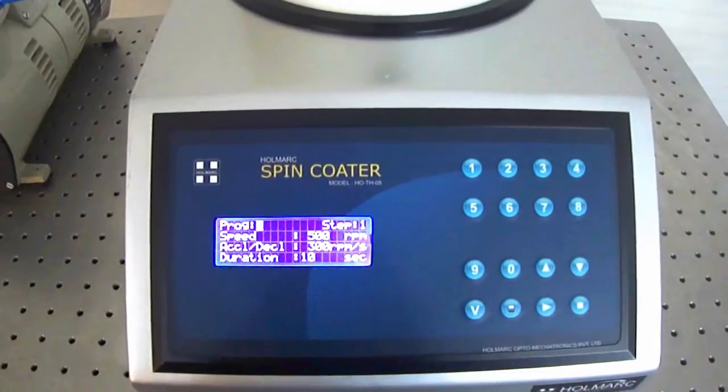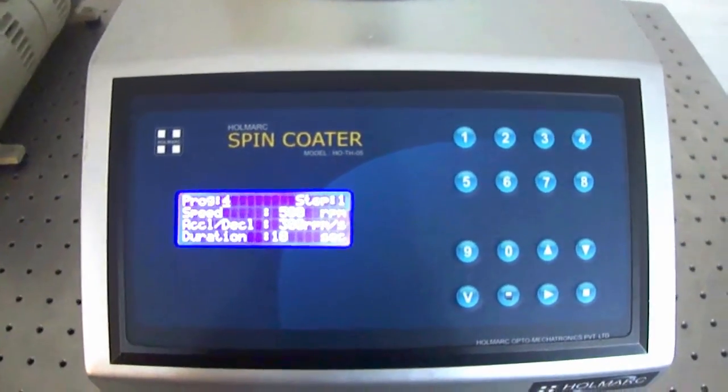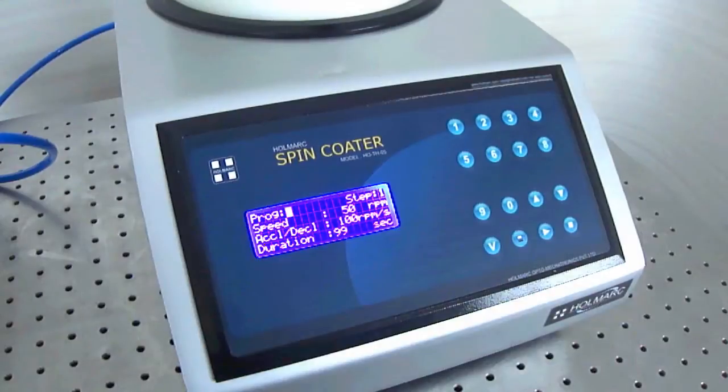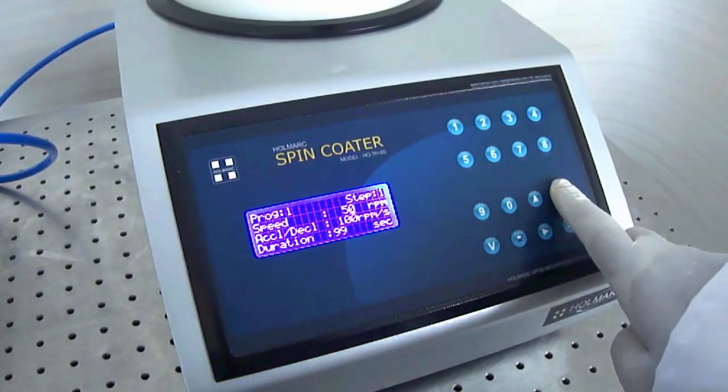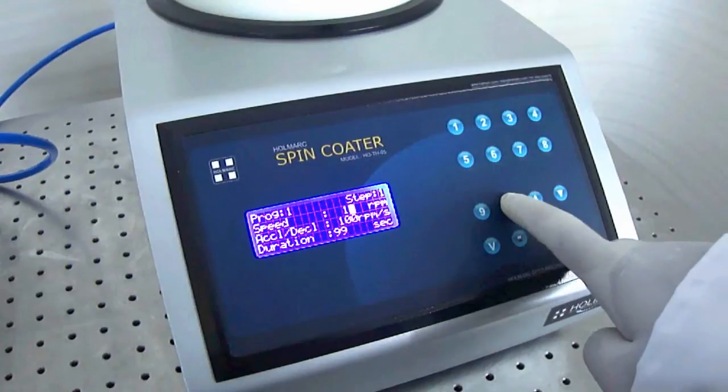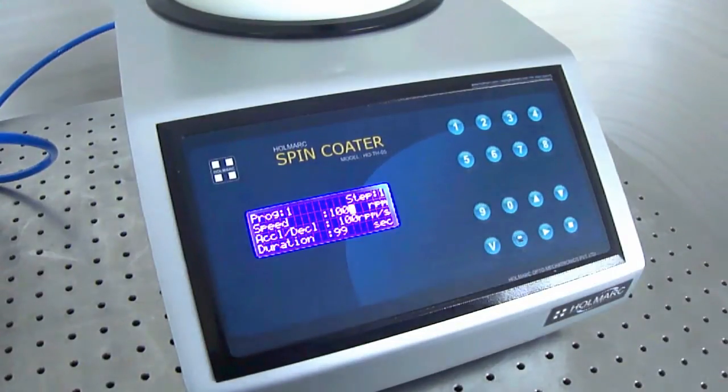The device has user-friendly keyboard and LCD display for programming various parameters. Spin duration, spin speed and acceleration can be easily programmed from the front panel keyboard.